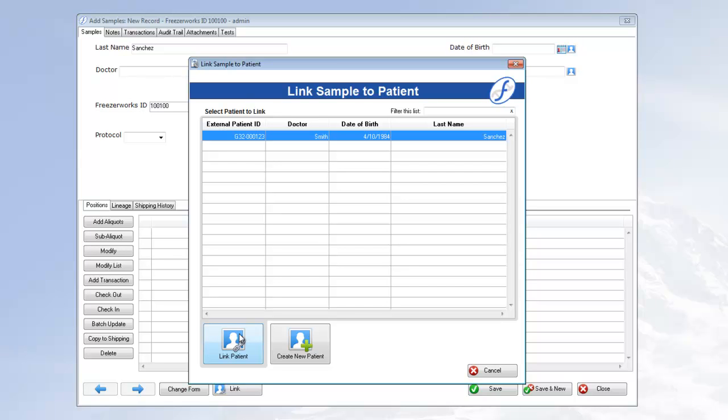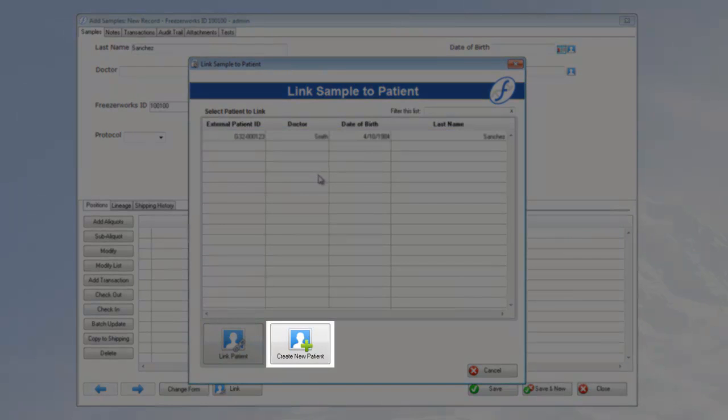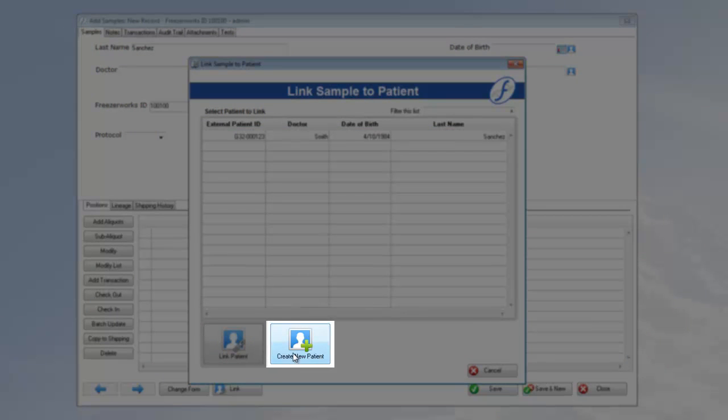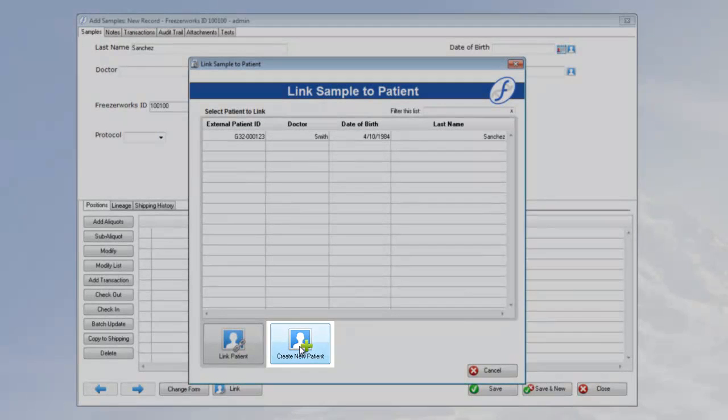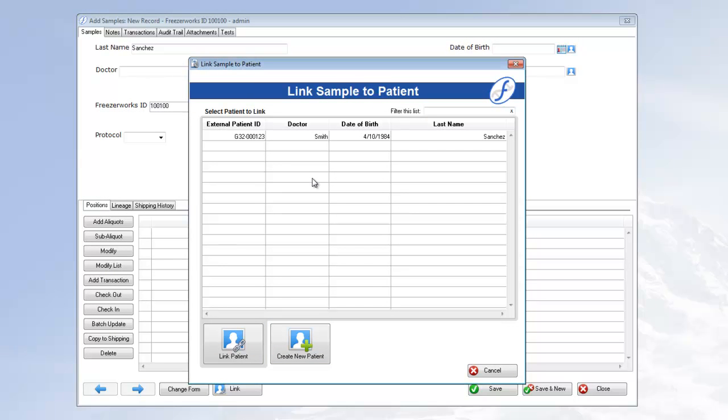If you don't see your patient, you can click Create New Patient, which will add and link a new patient record using the data you entered. Since we've got our patient right here, let's link it and watch the other fields fill in.